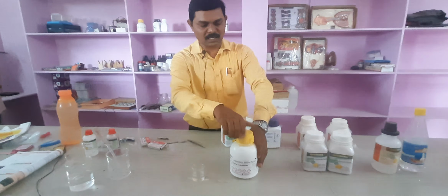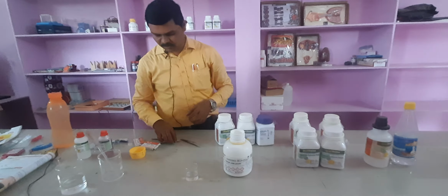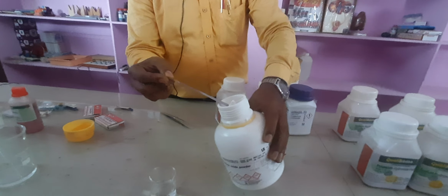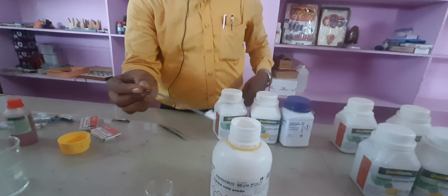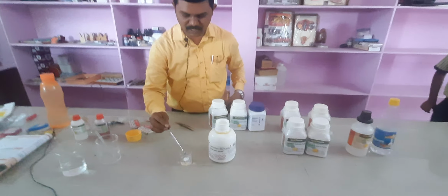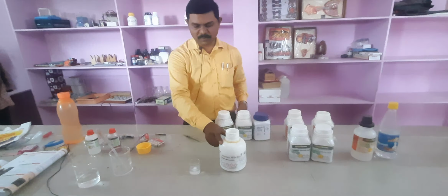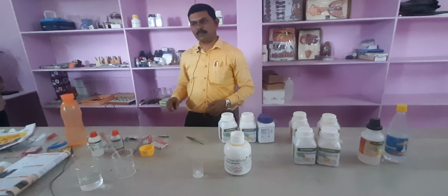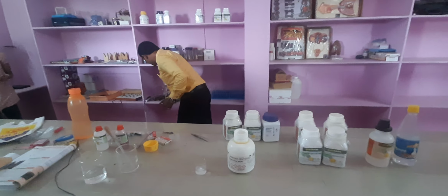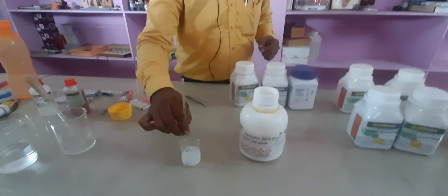You may have heard the lesson in the class, but now you see how the calcium oxide powder looks. This is the calcium oxide powder. Approximately 1 gram or more than 1 gram it will be. We are dissolving the calcium oxide in the water. According to our previous knowledge, when calcium oxide powder is dissolved in water, what happens? What is the new product? This is a glass rod to dissolve the calcium oxide in water.